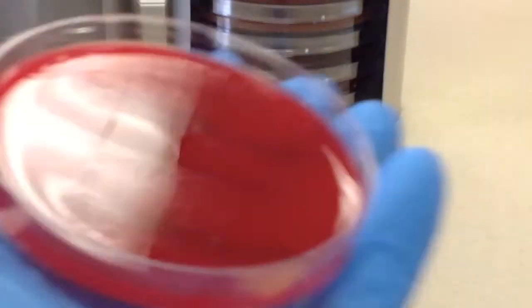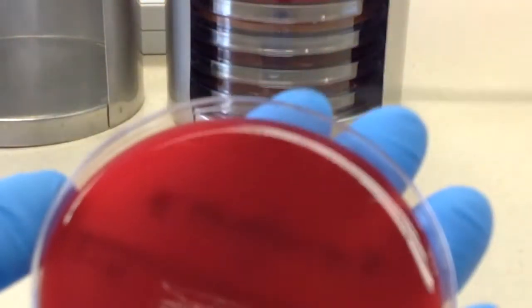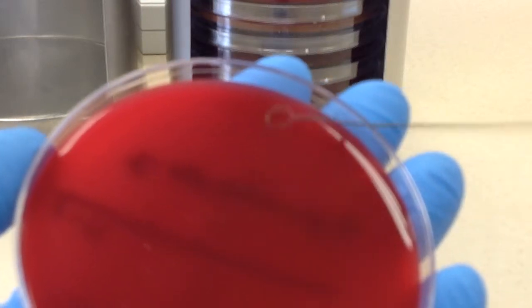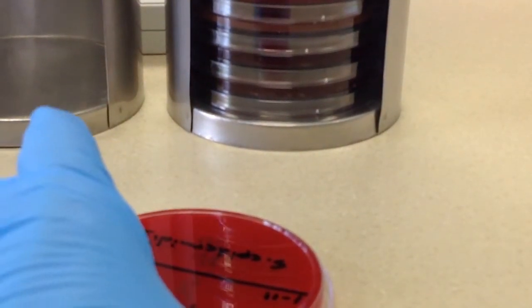Now another way you can do this, some people may use a sterile swab to pick up the organism and use that to place the organism and get it equally distributed on the plate.